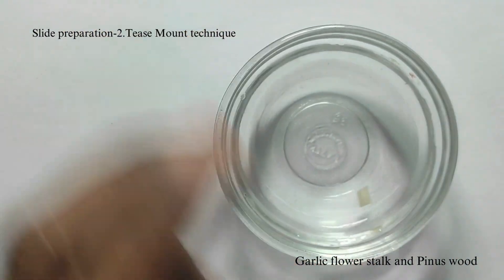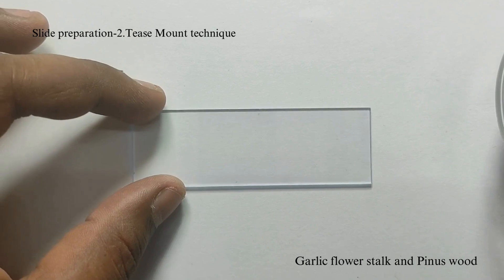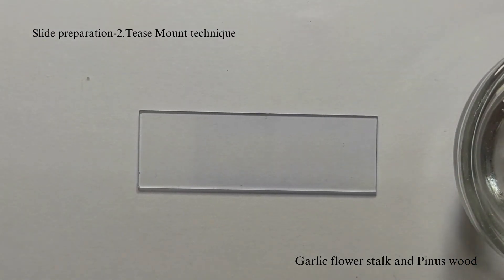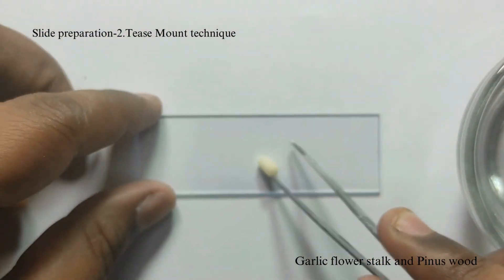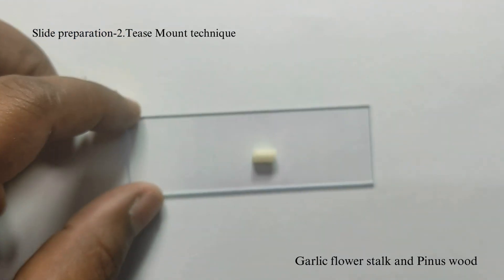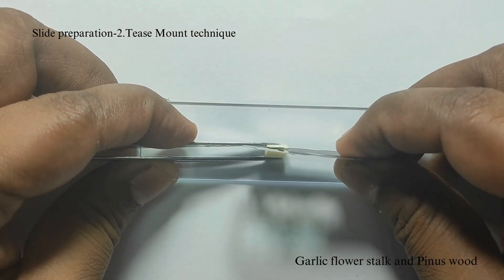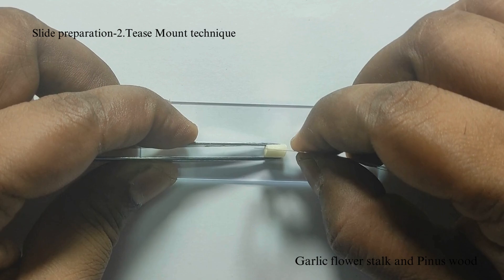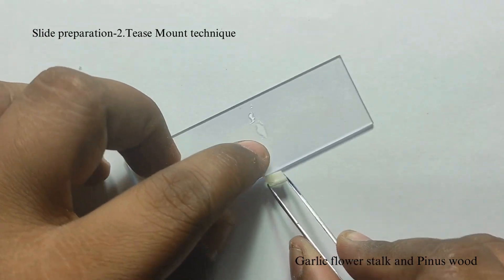Slide preparation using the tease mount technique. This technique is usually used for woody material. Take the macerated wood sample — here we have used the garlic flower stalk — and wash it in water. Transfer the material onto a clean glass slide and split open the material using tweezers and a razor blade.